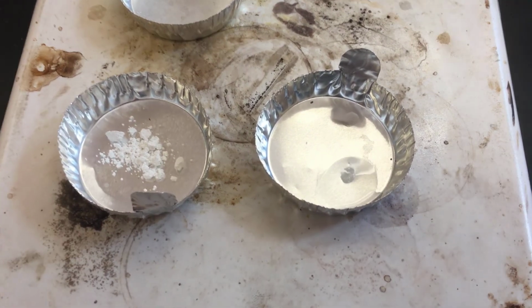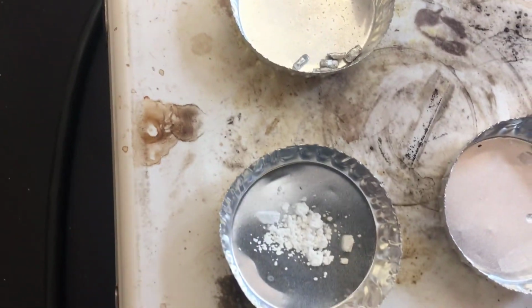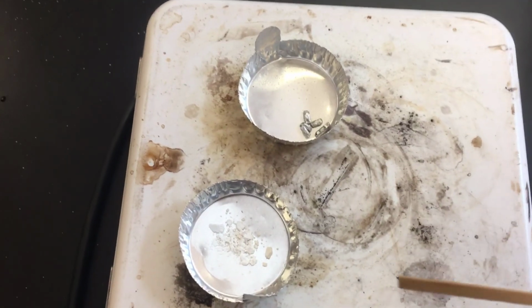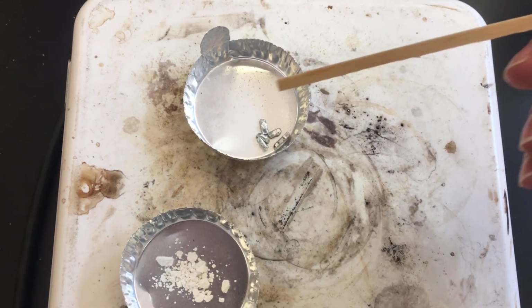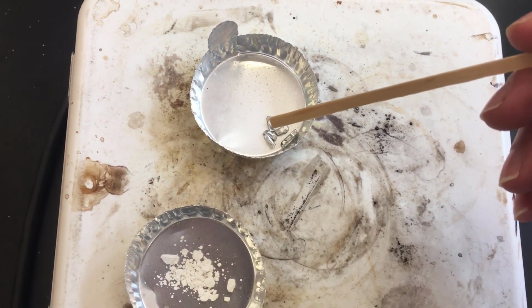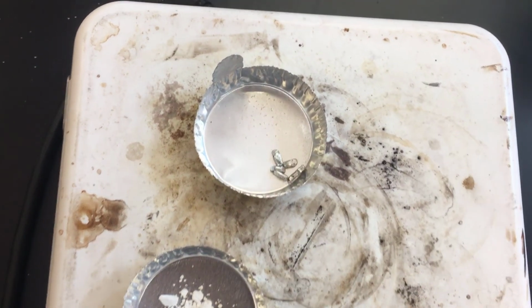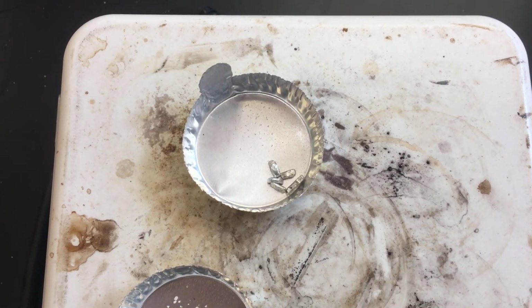And if you notice, this last one, sample 10, is now melting, where the other 2 are still hanging out. Okay, so the last 2, this one here, sample 4, still not much changing. In sample 2, it looks like not much is changing, but when I go to move them around, it appears that a couple of these pieces are starting to stick together. And that is the last of the melting data.